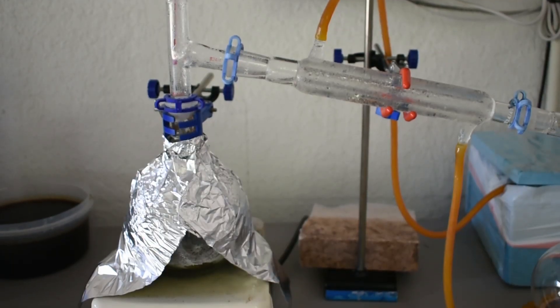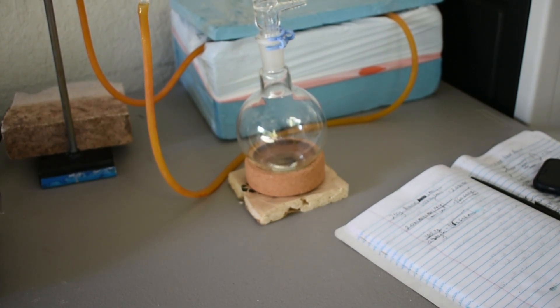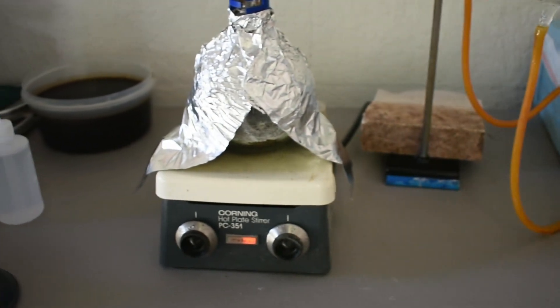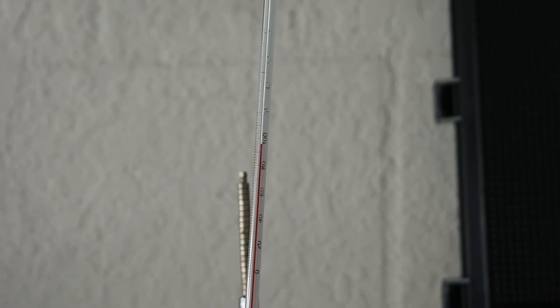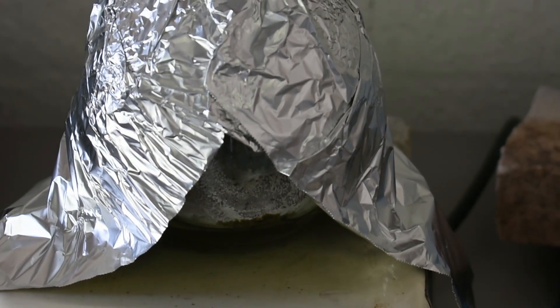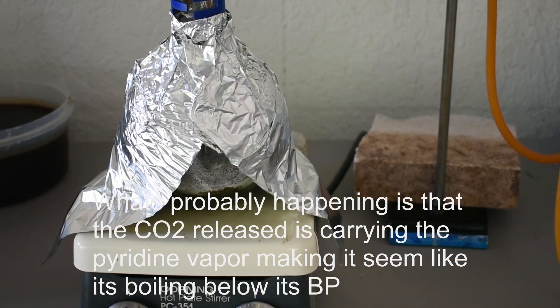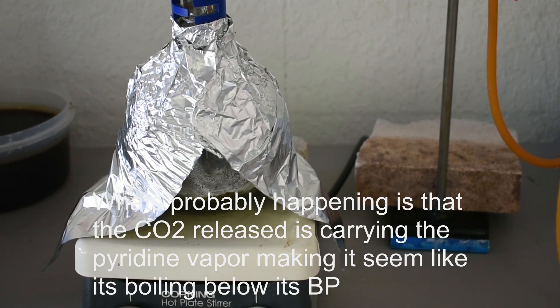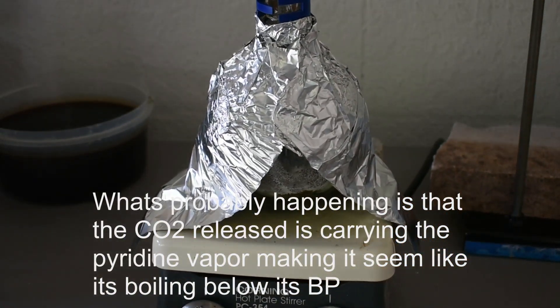The distillation has picked up quite a lot of speed. As you can see, we're getting a drop every second or so. The temperature is only at just under 100 degrees. My theory is that we're kind of steam distilling off the pyridine, as well as boiling it itself. Because its boiling point is 115 degrees. But we're obviously getting some distillate over there. My theory is that we're steam distilling, but I could be wrong.